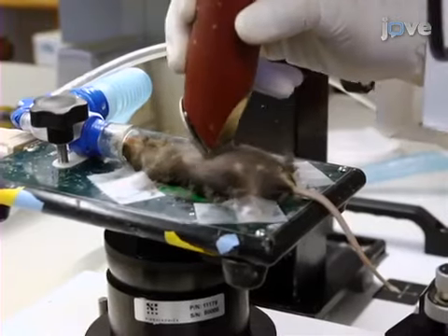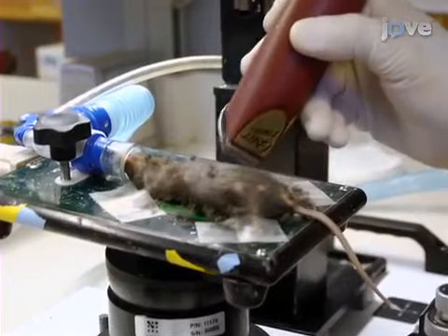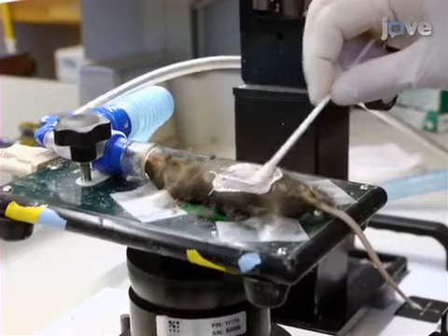Remove the mouse from the chamber and use hair clippers to shave its fur from the mid-chest level to the lower limbs. Then use depilatory cream to remove the remaining body hair.